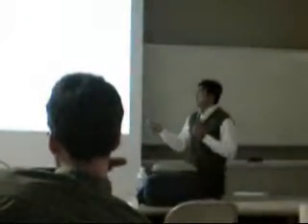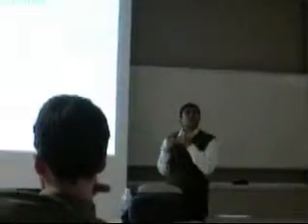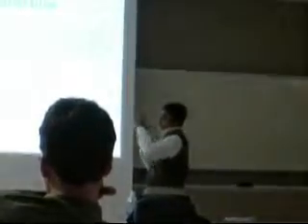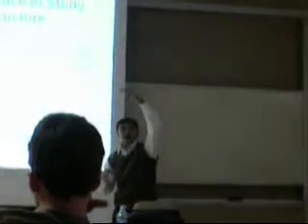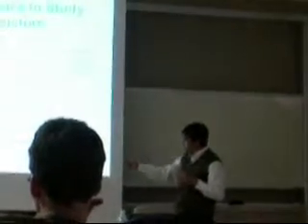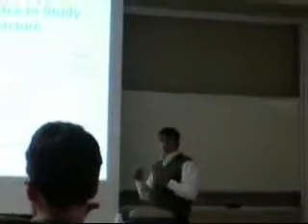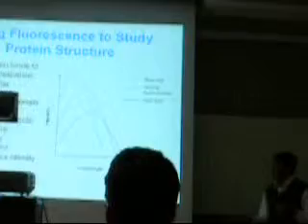indicated by a blue curve here. Which means that if our proteins and lipids are interacting, we should see a blue shift, which means shift to the shorter wavelength, and the fluorescence intensity should increase compared to the normal fluorescence, which is indicated by a green curve. And when the protein unfolds or if it's not interacting with the lipids, that means we have a red shift, which is indicated by a red curve.